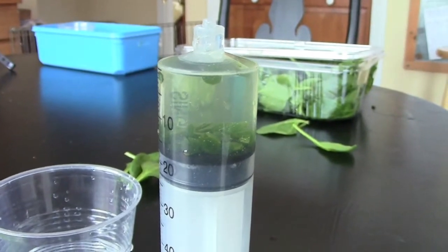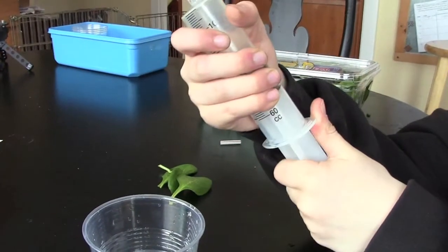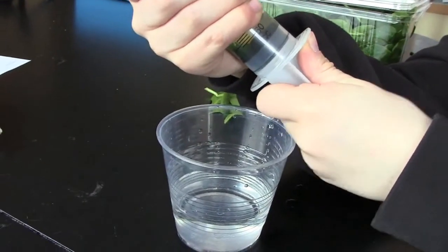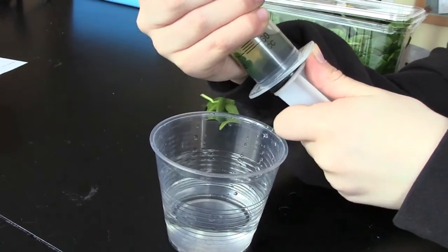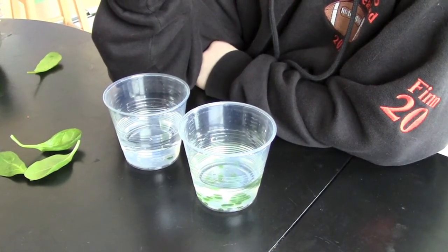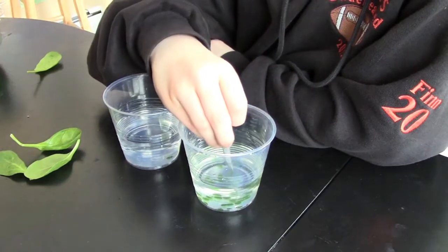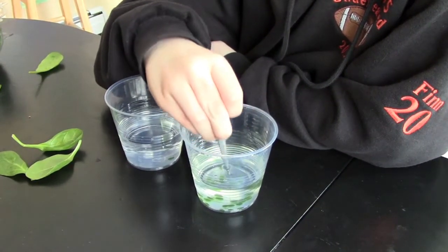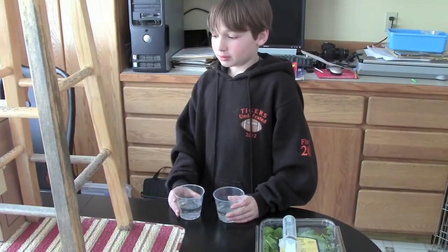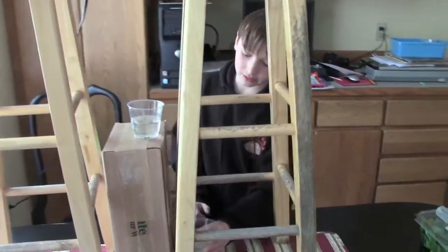Once all the leaf discs have sunk, you want to transfer them into the cup. It might be messy, but you want to do it over the cup. Next, we will transfer the leaf discs into each of the cups so they have an even amount of discs in them — one on the top and one on the bottom.